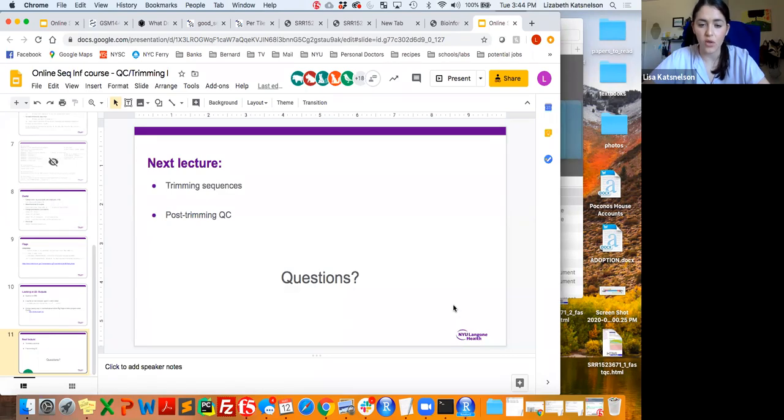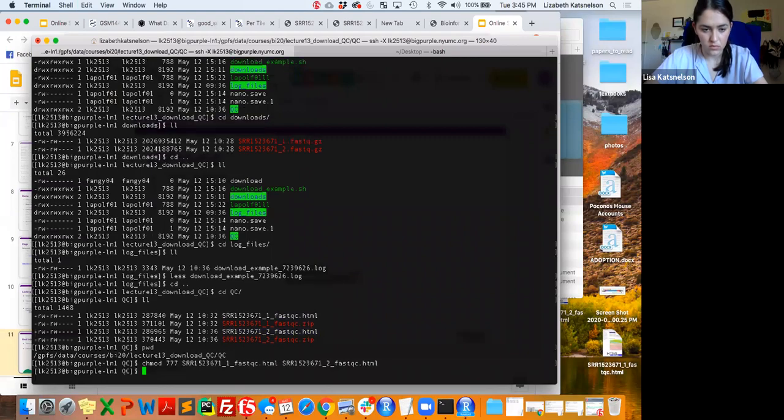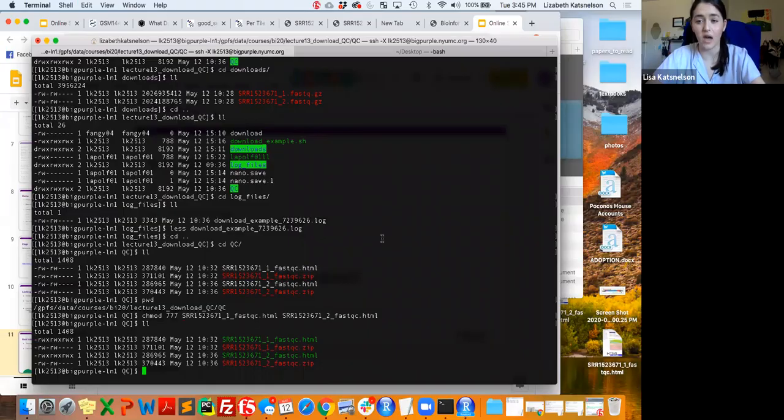If you're trying to copy over, okay, you guys might not have permissions to copy over these files. Let me check. Yeah, so I believe you actually might not be able to, let me change the permissions for these right now. Okay, you should be able to copy those over now. Sorry about that. You're going to see this is going to be super annoying. Every time you create a file, you're going to have to do something to the permissions.